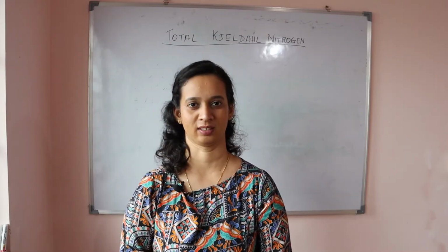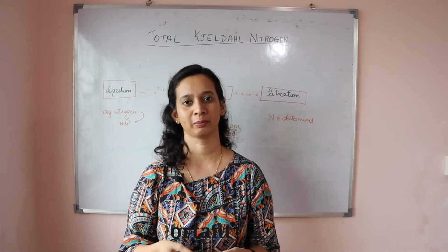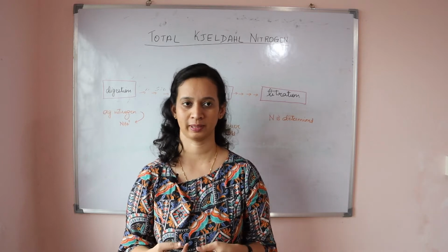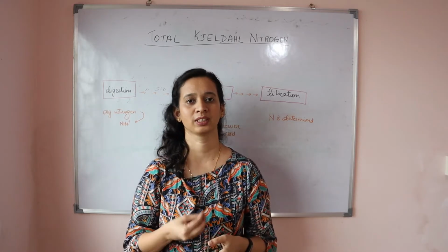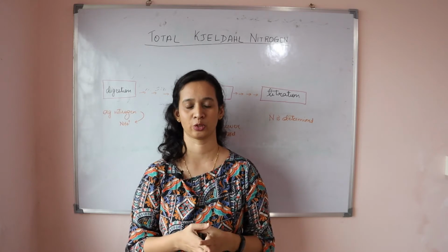We will see how to go about it. Let's get started. When any kind of treatment is done, whether it is wastewater treatment or any kind of treatment done on food, it becomes important to note how much organic nitrogen is present to see whether the treatment has worked or not. One of such nitrogen is Kjeldahl nitrogen, and we will see how to estimate this Kjeldahl nitrogen.